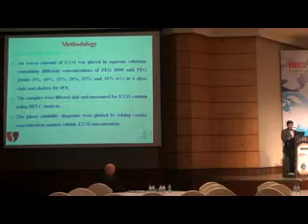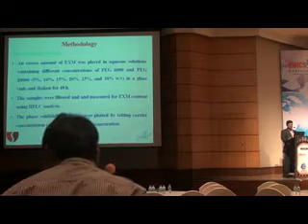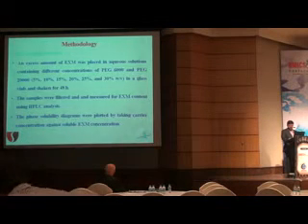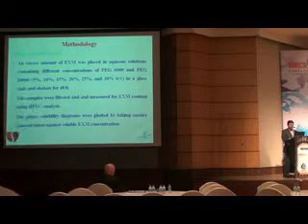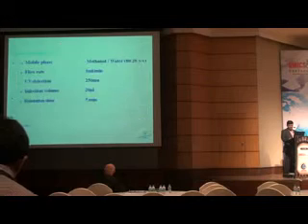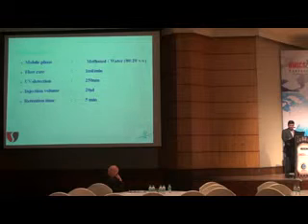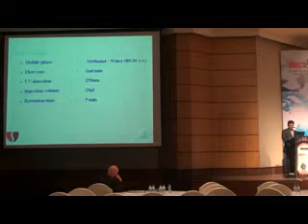So in this regard, we have conducted the phase solubility studies using the already reported Higuchi-Connors method, in which an excess amount of exemestane was placed in aqueous solutions of PEG 6000 and 20,000 at various concentrations ranging from around 5 to 30% in a glass vial, and shaken for 48 hours. The samples were filtered and measured for exemestane content by HPLC analysis. And these phase solubility diagrams were plotted as carrier concentration against the soluble exemestane concentration for understanding the profile.